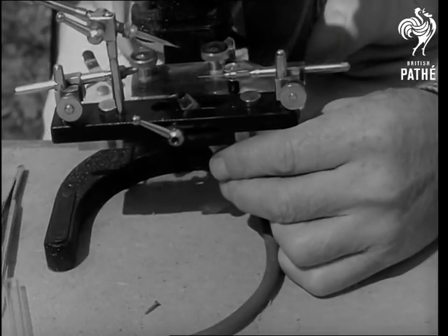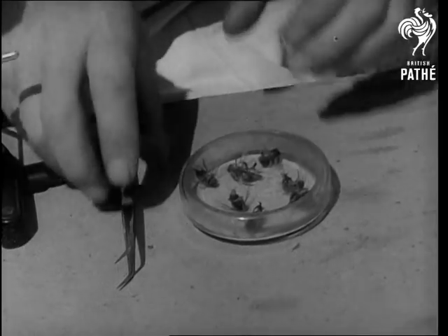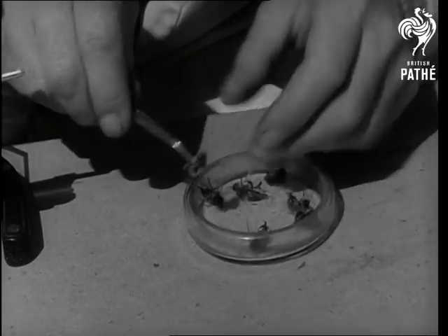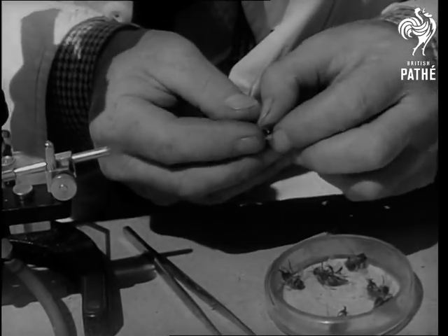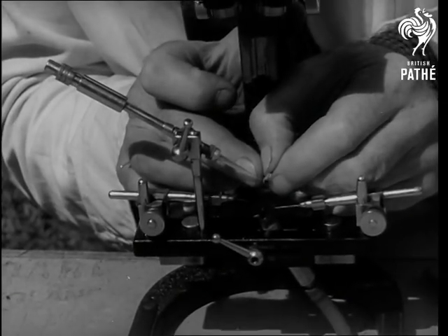The male bee, known as the drone, is carefully selected. He is then taken from his hive and allowed to fly in a closed room where he makes for the windowpane. When needed, he is just dropped into a jar of chloroform. Then, under the microscope for the extraction.